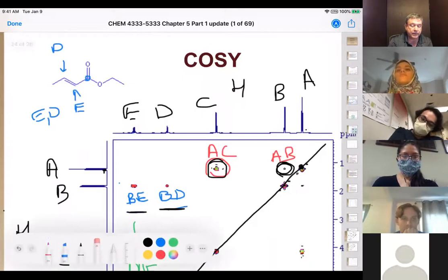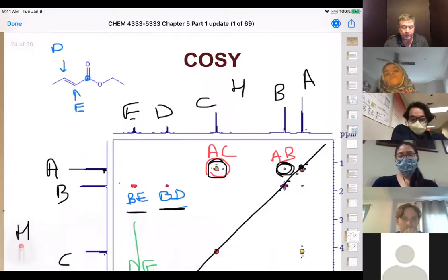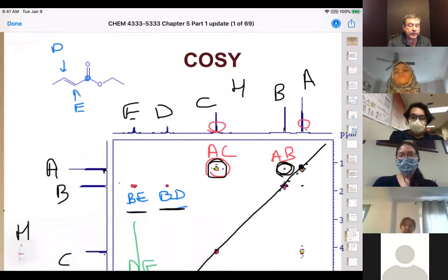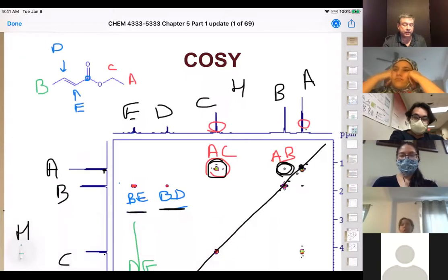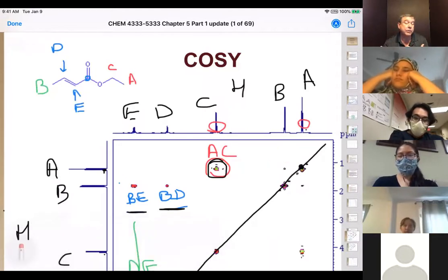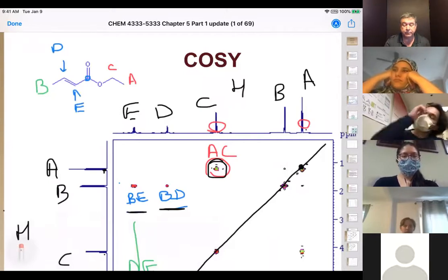Okay. So the next thing we would identify is that, based on where the position is, it looks like this C and A are the ethyl group here. Just by shifts, that's where we would identify them from. And that our B would be this peak here, okay? So that being said, I think this small peak here, this AB peak, is actually just an overtone of some sort and not really a true peak. So we're gonna look at the analysis of the rest of them, okay?